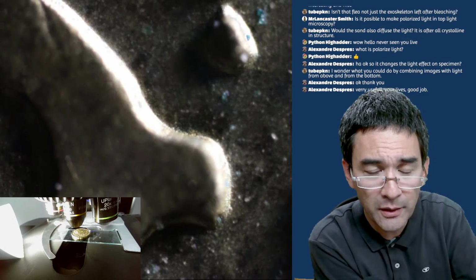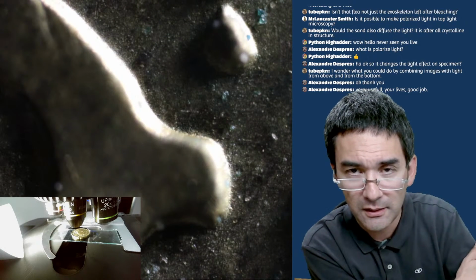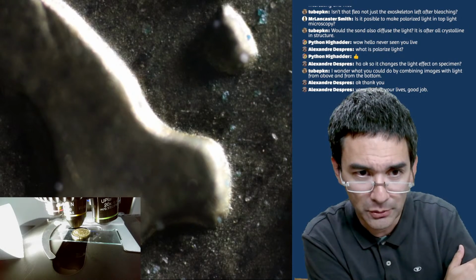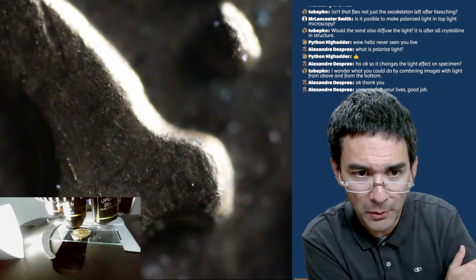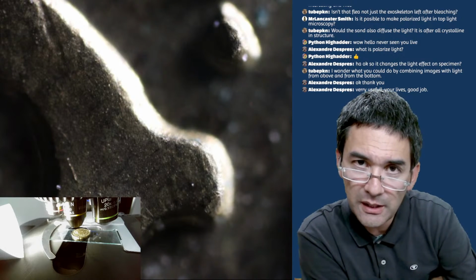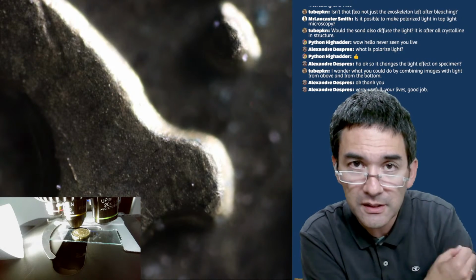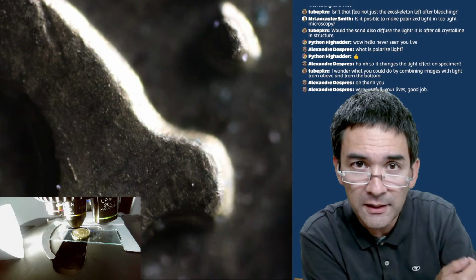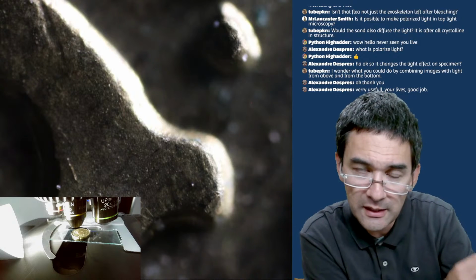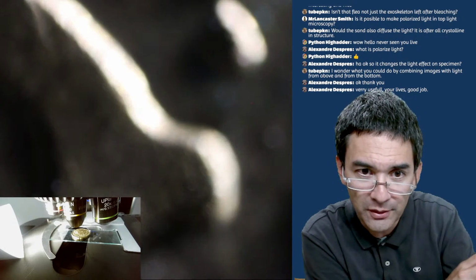You see right now the bottom part of the coin is in focus, okay? And the top part, which kind of stands out, is blurry. And now when I turn, now the top part is in focus and the bottom one is out of focus. And what you can do is you can now take pictures of both of them, and then using so-called stacking software, you can combine it into a picture which is completely in focus. So the software will take those parts of the images that are in focus only and combine them together.